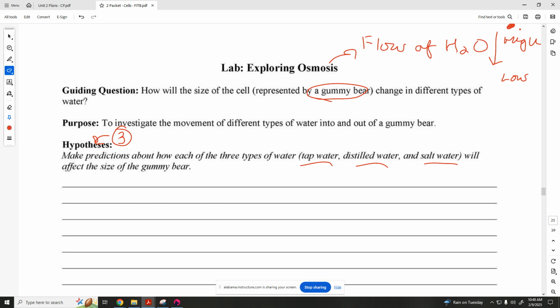So if I have a beaker of tap water, remember, tap water is not pure water. There's other things in here. We can have chlorine, fluorine or fluoride, maybe some trace amounts of sodium, maybe some sulfur also. So here, let's say that this is 90% water.